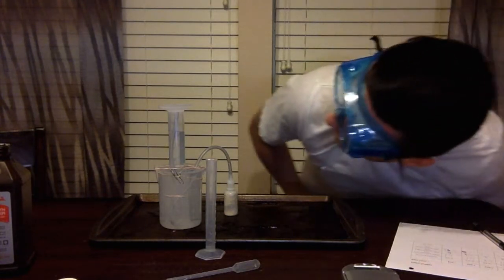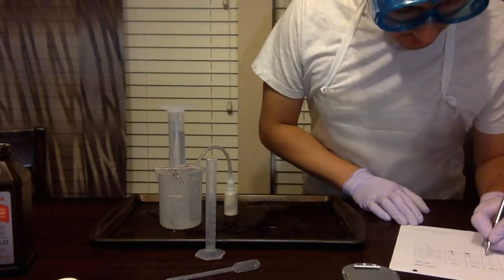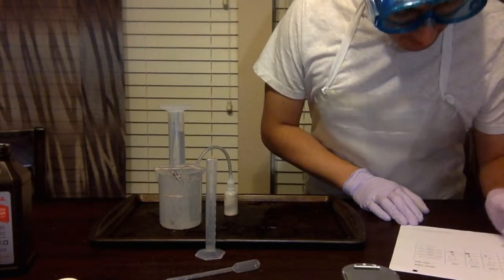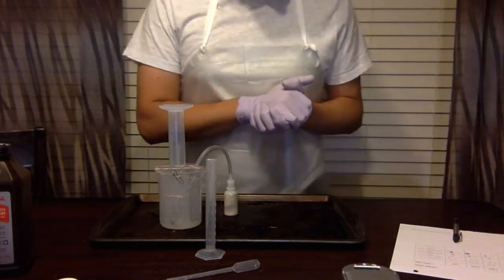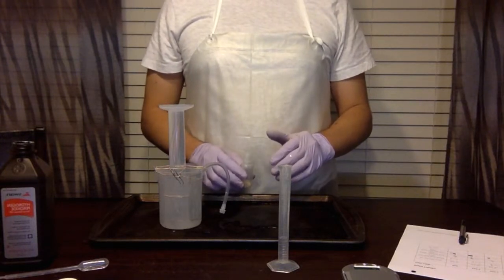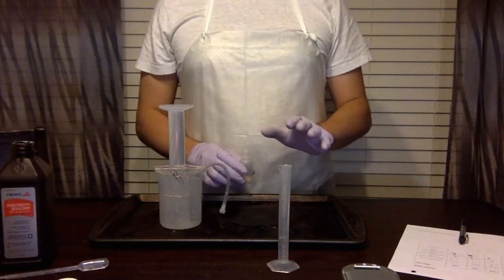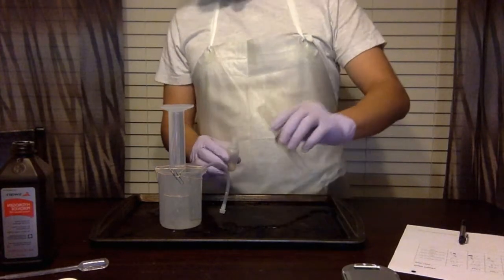Looks like it stayed at a steady 15 milliliters. So we're going to go ahead and record, and then we will commence trial number 5. Commencing trial number 5. Again, quick reminder: this is with 3 milliliters of hydrogen peroxide.